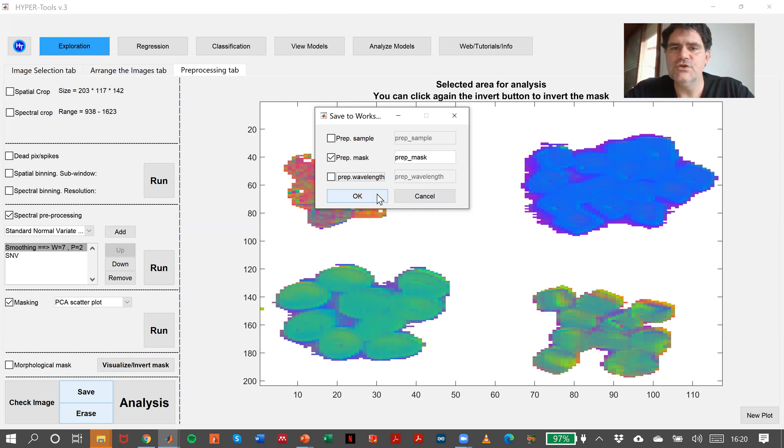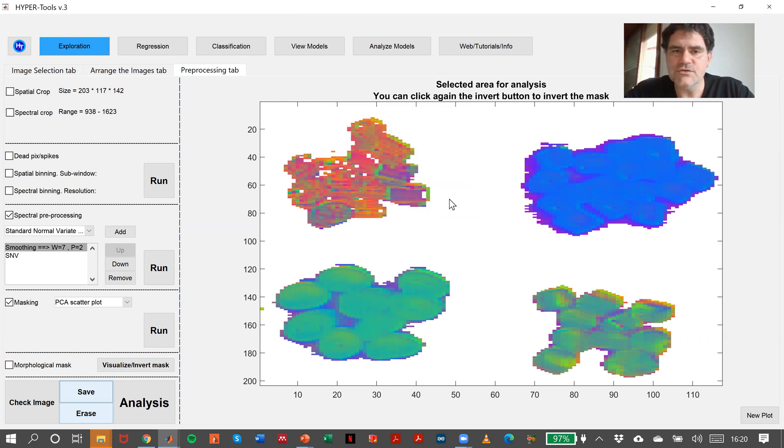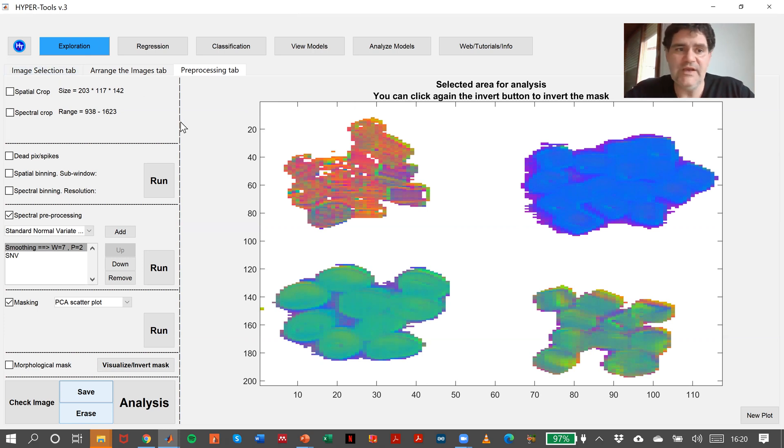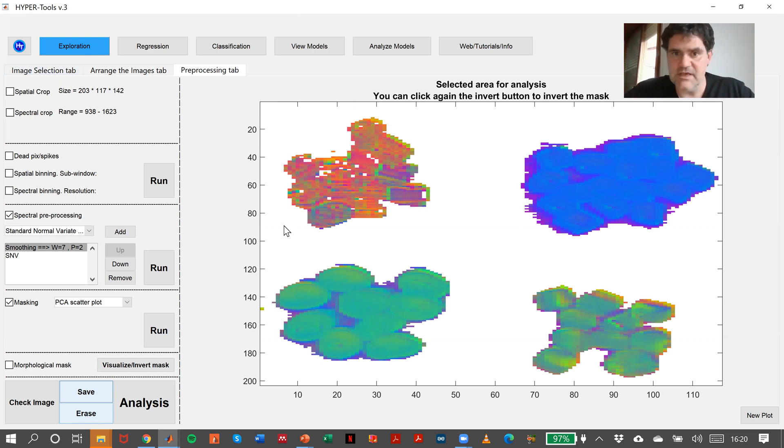We can save the preprocessed sample, or we can save only the mask. So afterwards, in order to load this image again, we could load it with the proper mask. We can escape all these steps in order to arrive to this point.